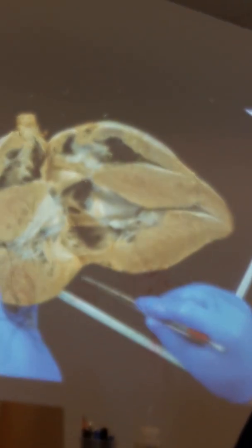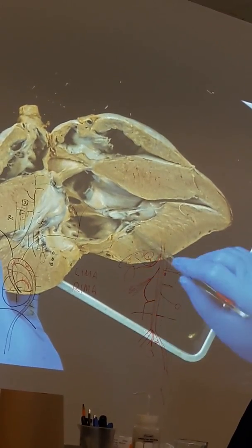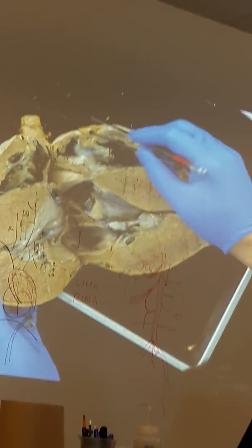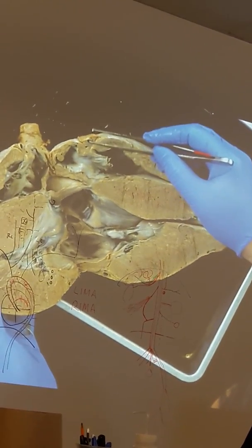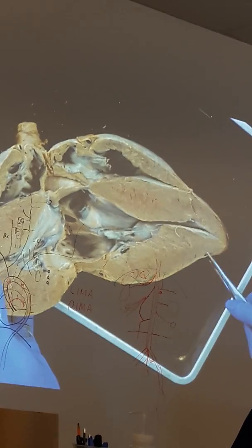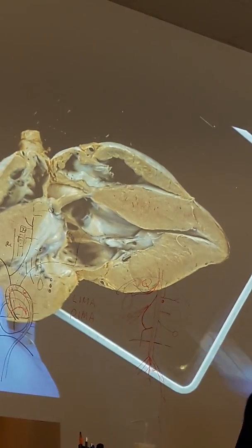If you want to tell the difference of the artery and the vein, normally the artery is smaller and has a thicker wall, and the vein is much bigger. Okay, artery is smaller. Okay. This one looks to me, it's kind of like an artery. Okay, it's circular shaped, not irregular shaped. Okay, and large lumen normally is the vein. Okay, this one is much thinner, probably is a vein. Okay.